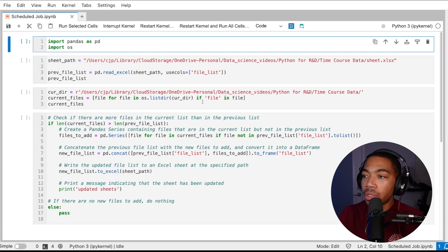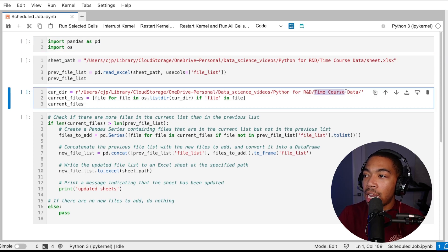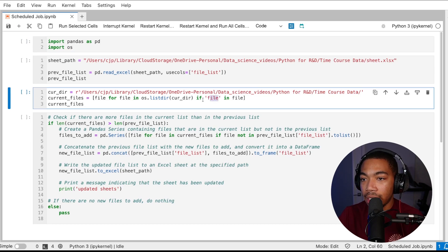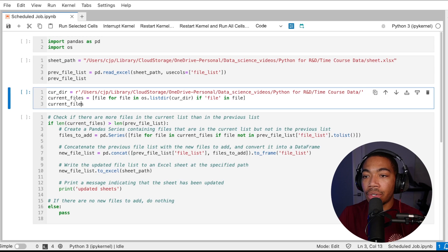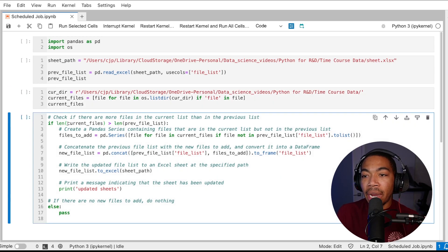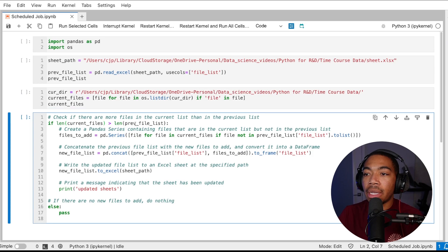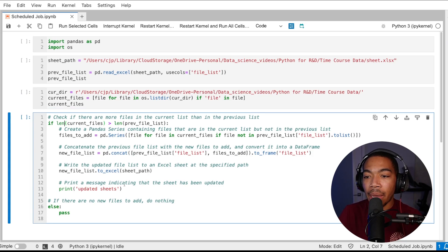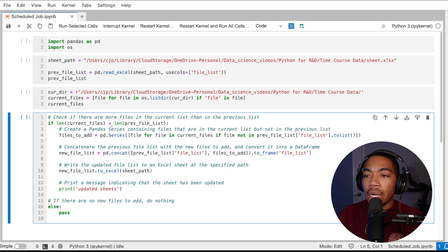We are also going to look in this time course data folder for any file with the name of file in it and generate a list called current files. In the final cell we're just going to compare the length of current files to the length of the previous file list and if these are the same nothing happens.